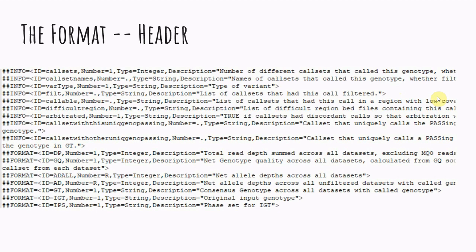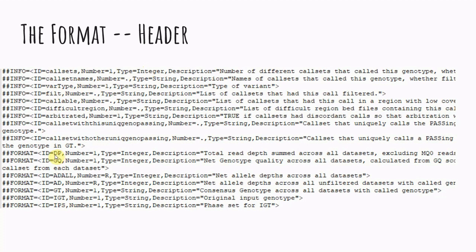VCF files also have headers. All of those different notations that you see in the info field and the format field, those will all be listed in the header. And this can be useful because a lot of times there's a lot of differences between VCFs and you won't know all of the annotations there in the info field or format field. So if that's the case, you can come up to the header and each one of those notations, like for example, here DP says that this ID equals DP. Then you can look at the description and says the total read depth. So this will give you a sense of what in fact you're looking at.